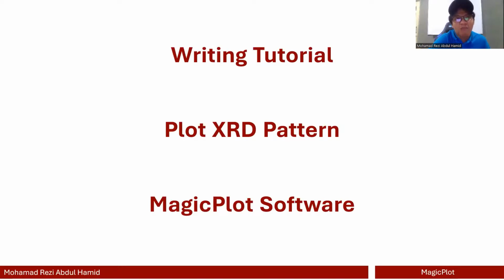Unfortunately, the software that I have is a free version. It is a student version. So it has very limited, or basic, I would say, functions as opposed to its commercial or full-spec software.